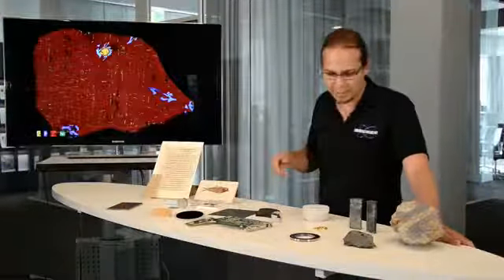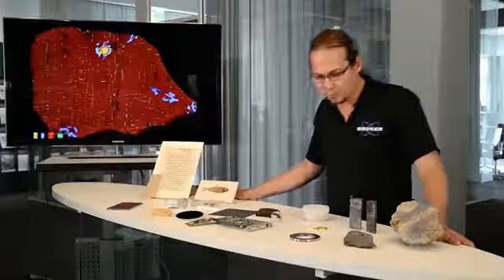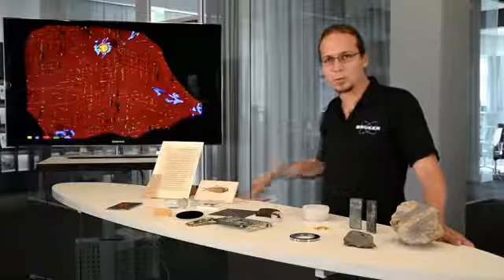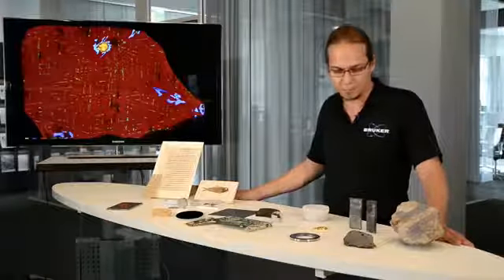We have the possibility to measure industrial samples where it's not only interesting to know the composition of the metal but also what are the elements on the surface of the material.